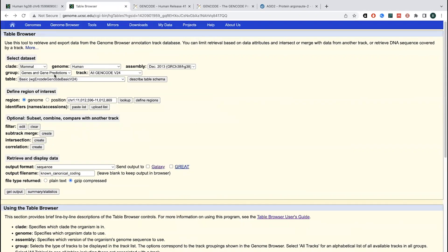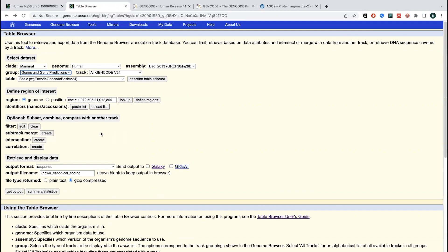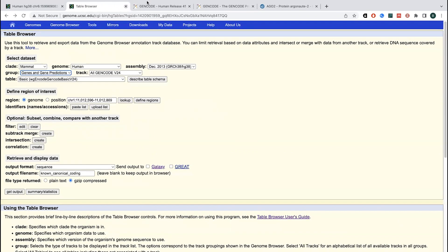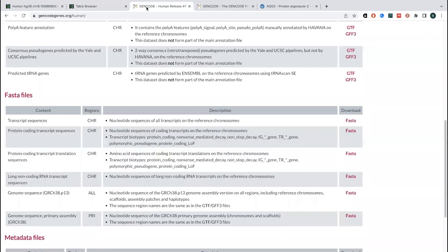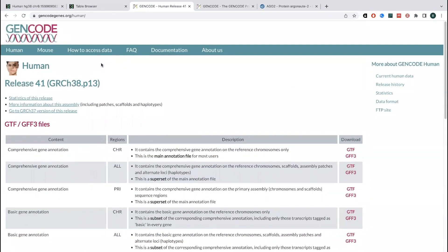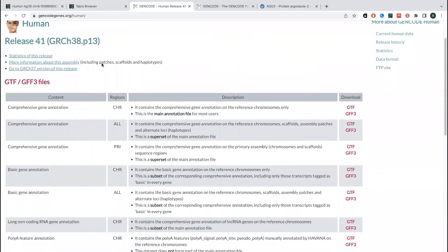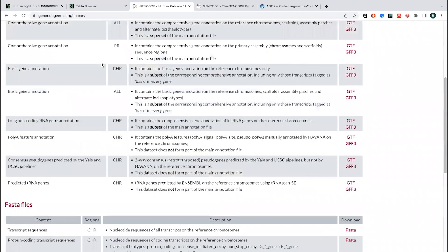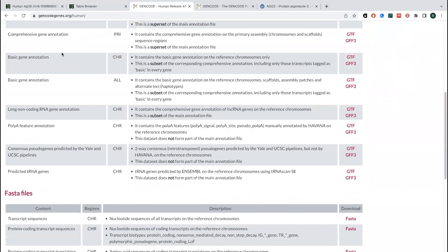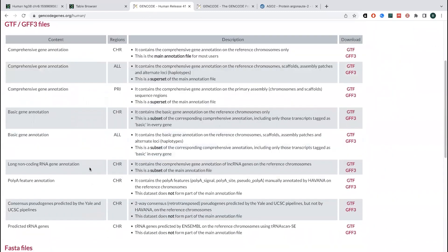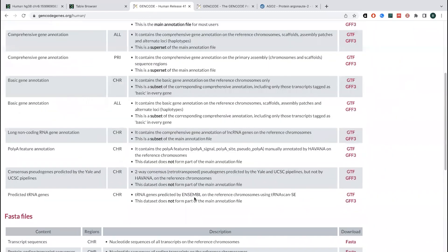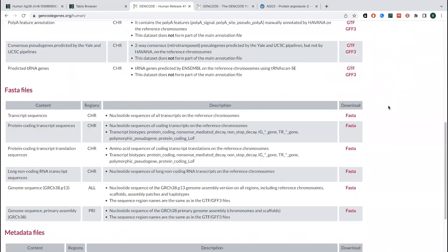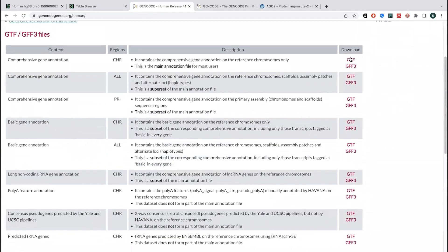If there's really specific data you want, you can also get things for - basically there's a lot of different options that you could do. This is for downloading the actual data. If you want to filter it in various ways, if you want to get the gen code transcript data that most people use, and as well as the human genome release, you can all get this through gen code. And so the FASTA file, that's going to be your basic sequences.